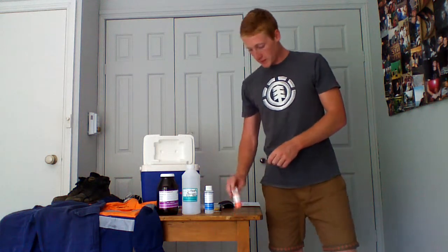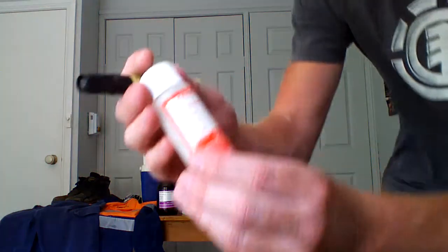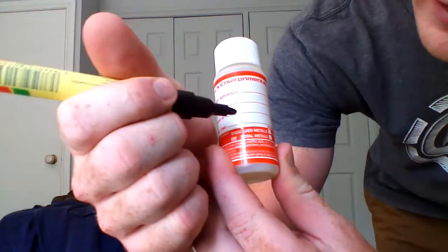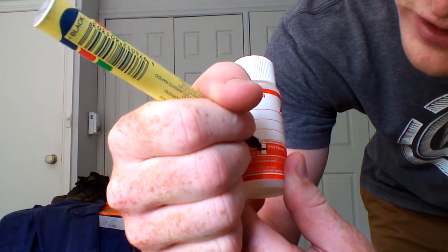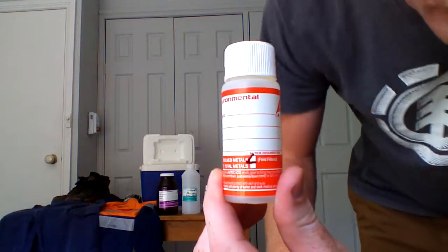They've also requested metals. We can do tests for dissolved metals or total metals. Fill out the same details along here, however dissolved metals must be filtered, and we need to tick one of these. SCIT2100 requests a filtered dissolved metals sample, so we'll also be sampling with this bottle.